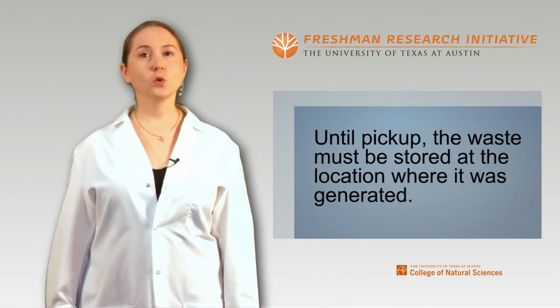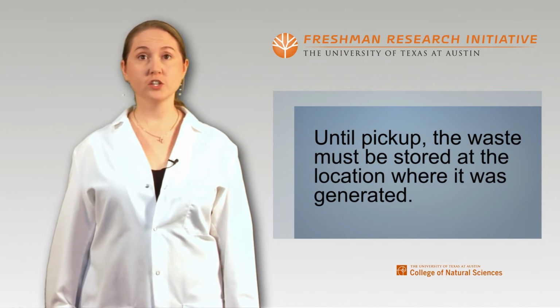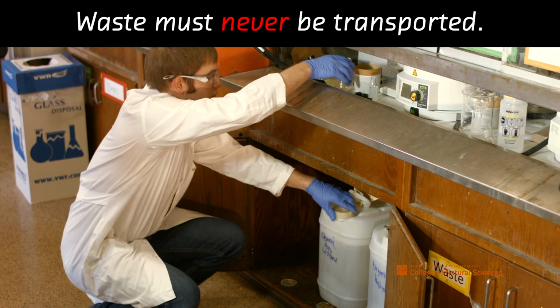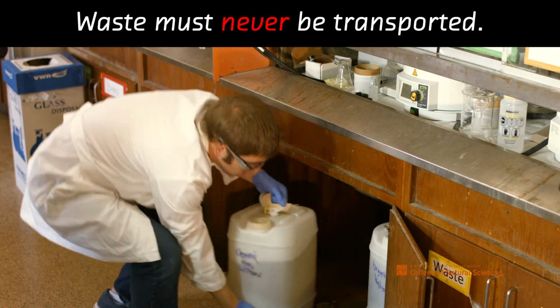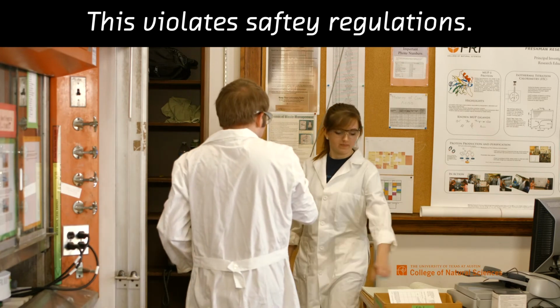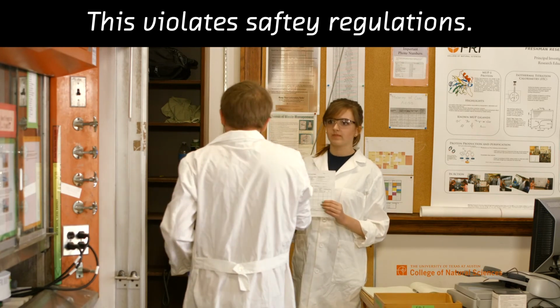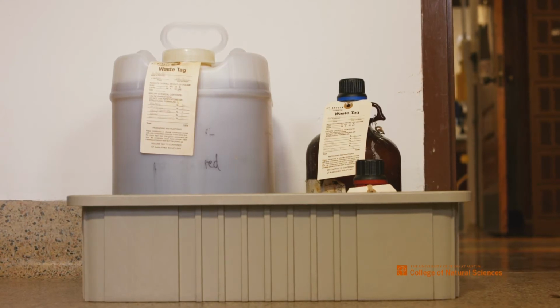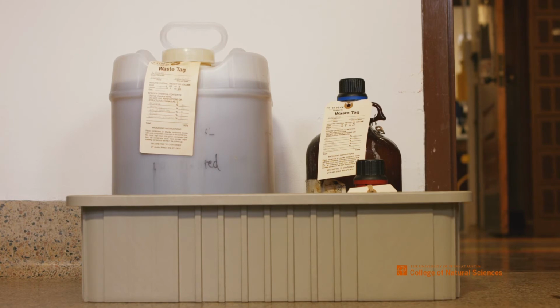Until pickup, the waste must be stored at the location where it was generated. Waste must never be transported to another room for pickup. This violates safety regulations, and the laboratory generating the waste can be cited for doing this. Liquid waste stored on a lab floor must always be in a plastic secondary container.